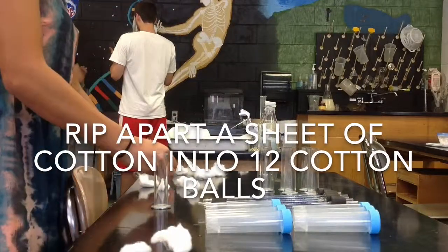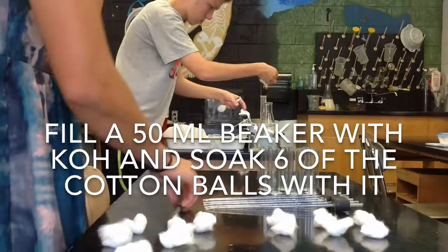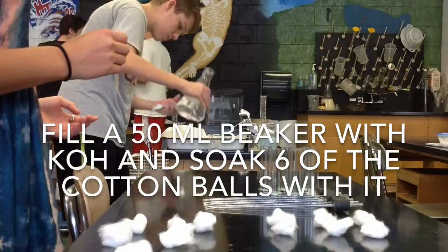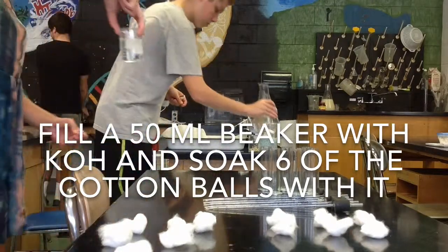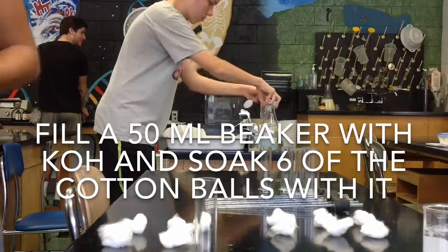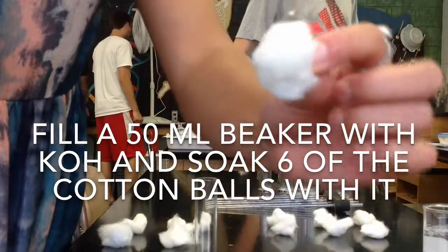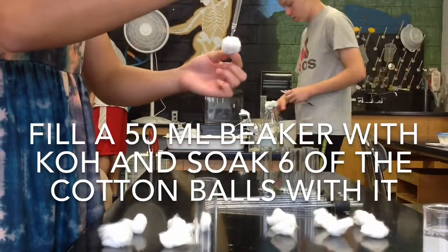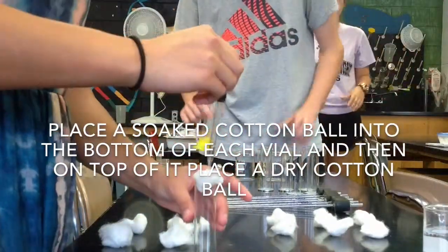Sixth, rip apart a sheet of cotton into 12 cotton balls. Seventh, fill a 50 milliliter beaker with KOH and soak 6 of the cotton balls with it. Eighth, place a soaked cotton ball into the bottom of each vial, and then on top of it place a dry cotton ball.